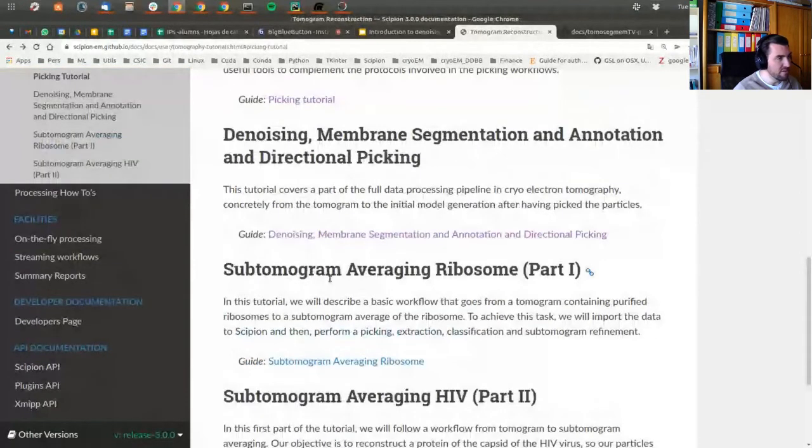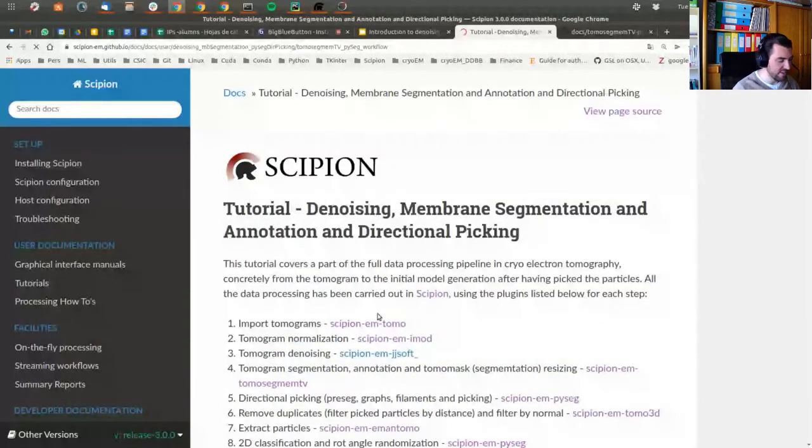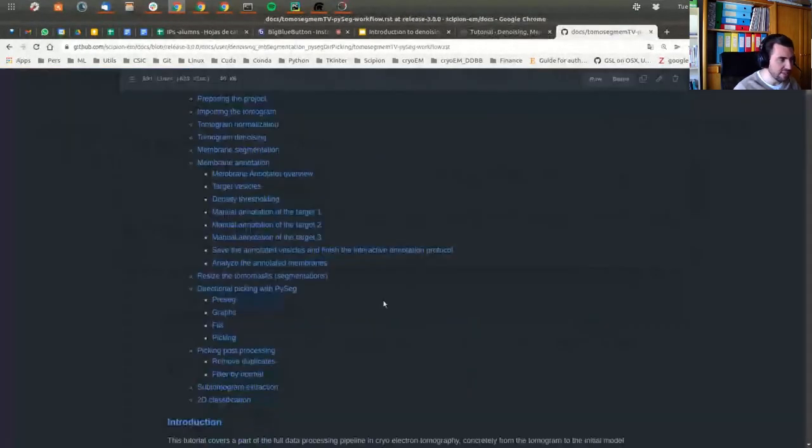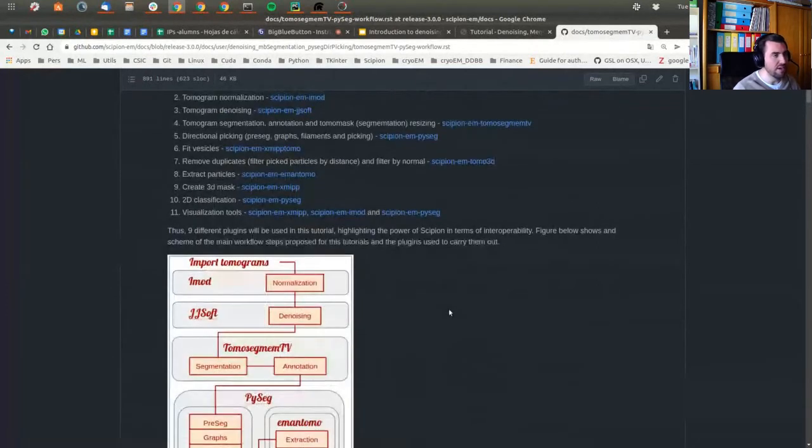From my part, the final version is not ready. It is the last before the course. I made some other changes, so I'm going to provide this other link, the source code page on GitHub, just to provide you to follow during the course. I'll follow this guide during both the theoretical and the practical parts. I think it's better to have all of this at hand, so we can, for example, concrete the doubts, or maybe provide a better understanding of the reasoning behind one value or another.